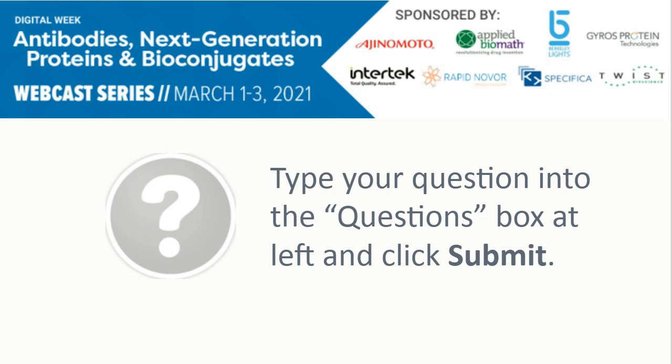Okay, great. Next question. Can you work with alloy mice, human IgG transgene mice? That's a great question. We haven't yet, and we would be keen to try. We've been spitballing this question of working with mice for some time, right?